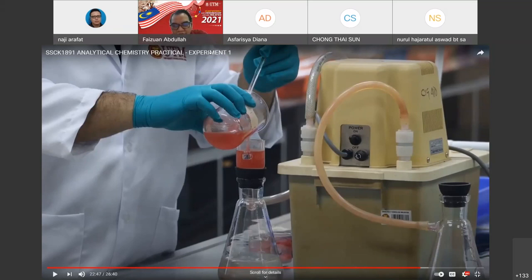All right, good. Right, because we do the gravimetric analysis, we need to obtain the precipitate, and then we need to measure the weight. From there, we can determine how much is the analyte. In this case, what is our analyte? What is our analyte, guys? Nickel, right? At the end of the experiment, we can measure how much nickel is in the sample.